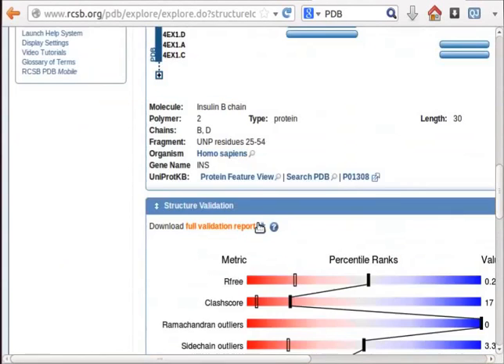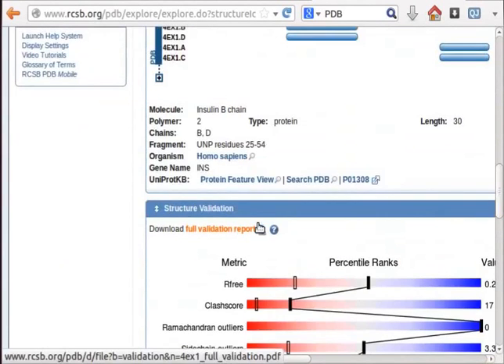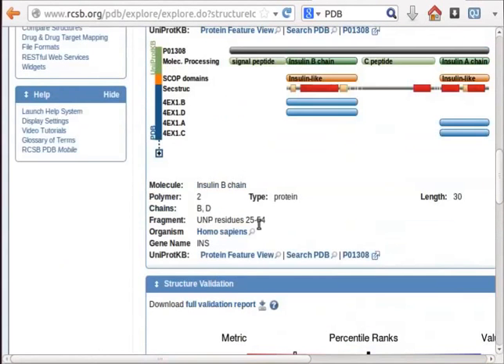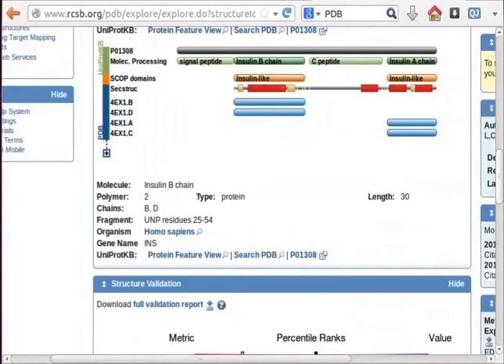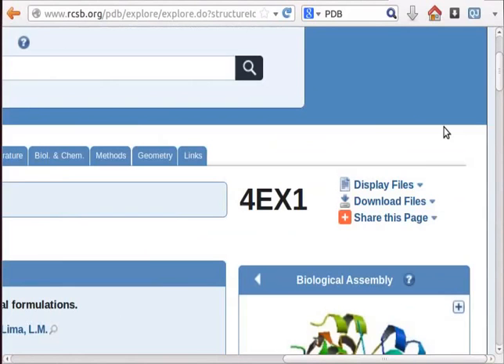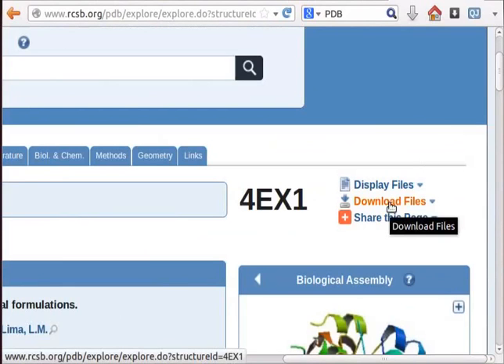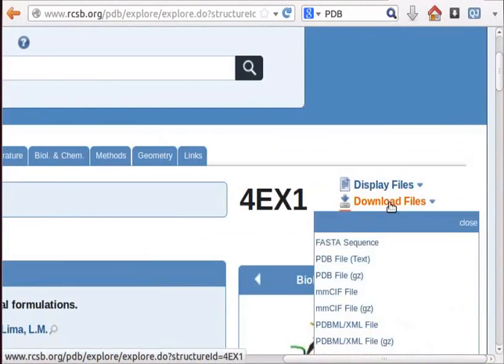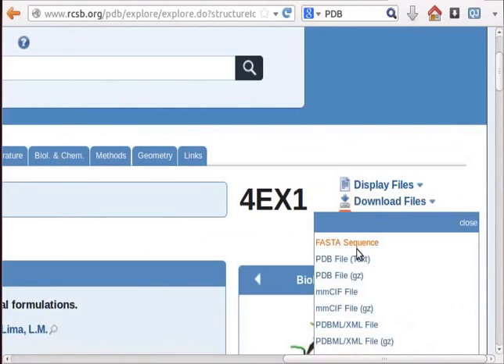Click on the download files link located at the top right hand corner of the page. From the drop down menu, select pdb file gz option.